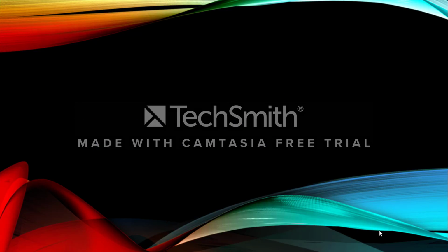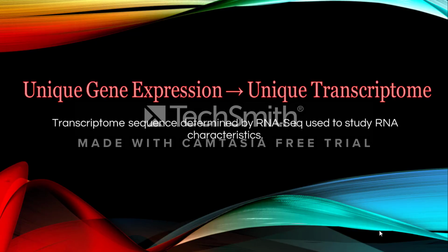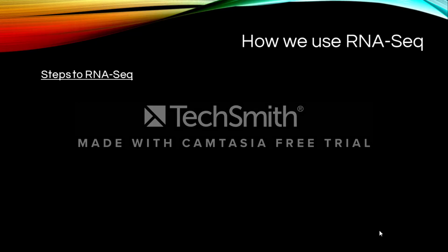Since RNA-Seq shows the unique gene expression of your gene, by doing this you're able to discover your gene of interest's unique expression, which in turn equals your gene's unique transcriptome. With measuring the unique transcriptome by doing RNA-Seq, you're able to discover more RNA characteristics about your messenger RNA. To perform RNA-Seq, there are 6 basic steps to follow.